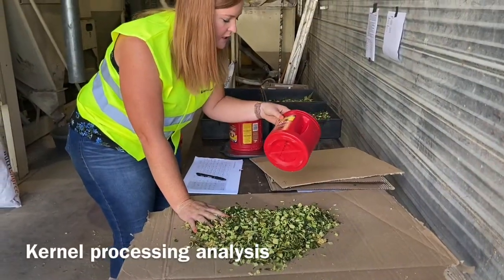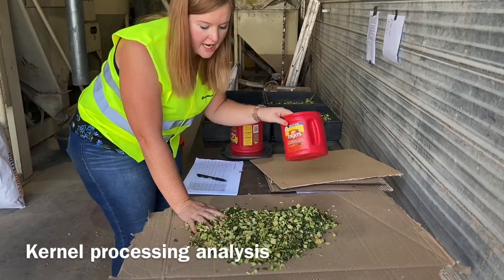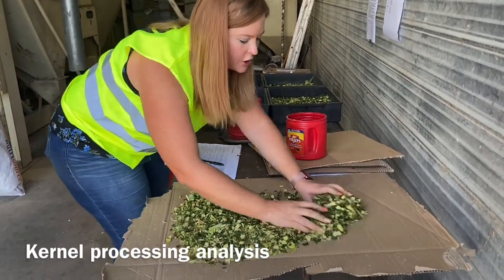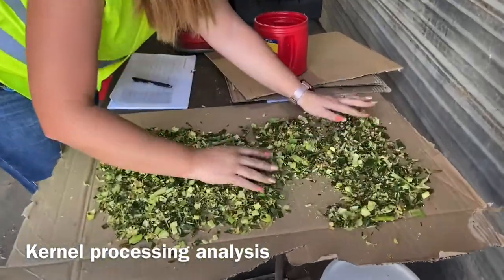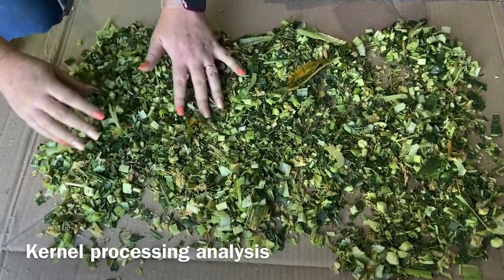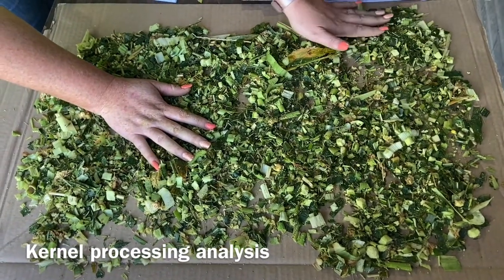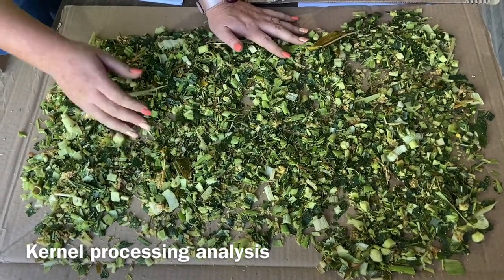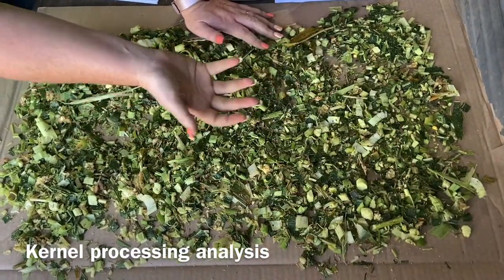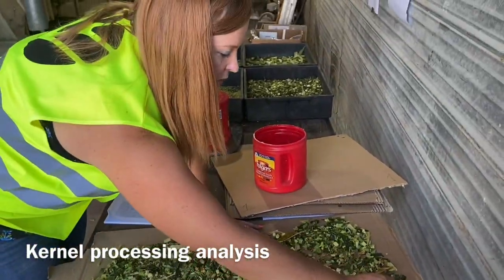We're using a coffee jug because you're supposed to use 32 ounces, and this is 32 and a half — it works quite well. You grab a sample, spread it out, and look for whole kernels. In a 32-ounce container, we don't want more than two whole kernels. If a kernel is nicked or a little bit squashed, that is fine — it does not count as a whole kernel. Whole kernels don't get digested in the cow; they pass through and end up in the manure, and we lose starch — and starch is costing us money.